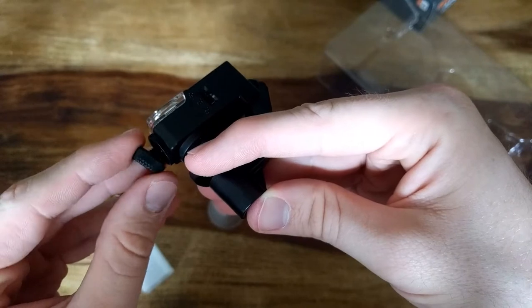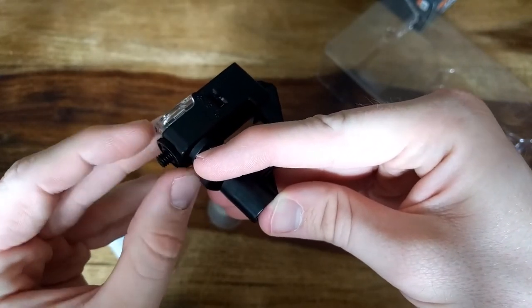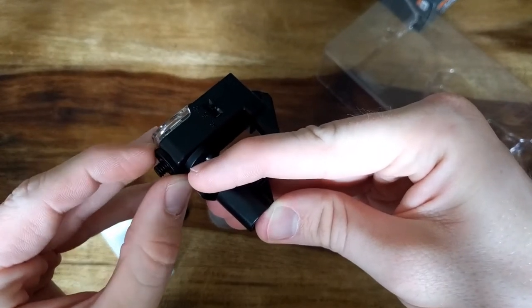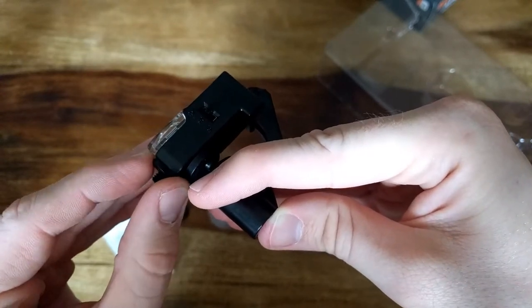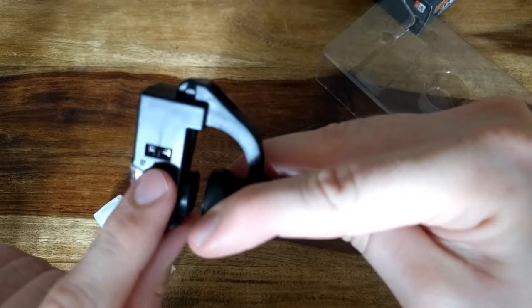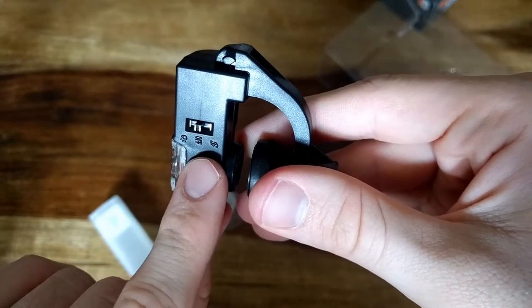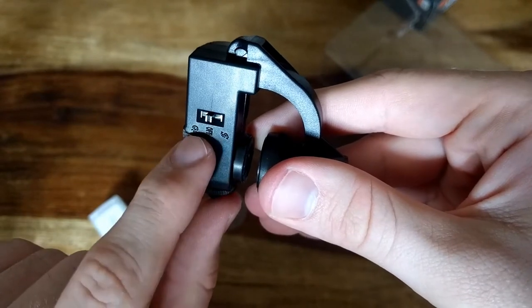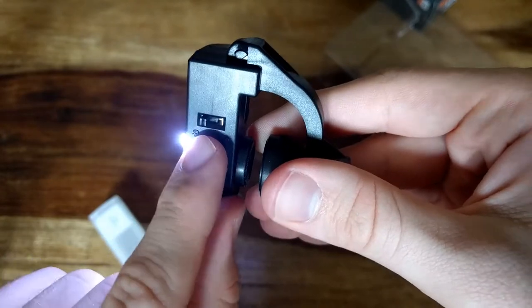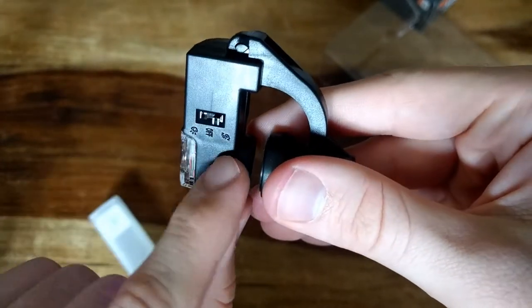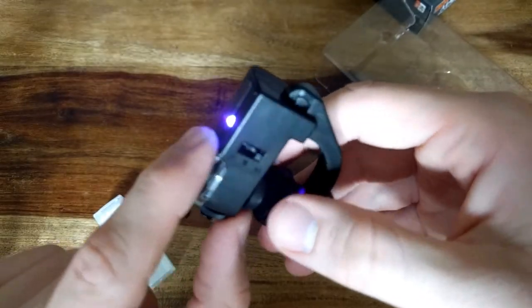This thing I'm spinning here is a lock mechanism for the focus. This is the focus itself. I'll show you later. You can see a button here with three positions: one is off as it is now, one is with the light, and one has some kind of symbol and it is UV light, ultraviolet light.